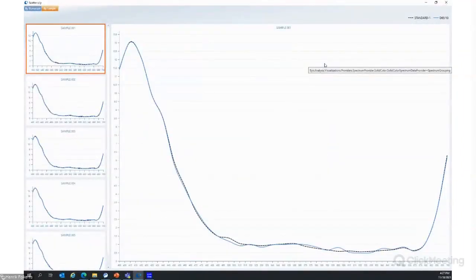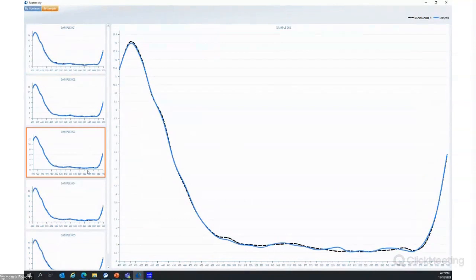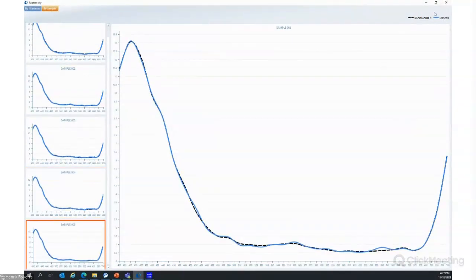That's why I have to move it to this screen I shared. You see, clicking on standard, it's highlighting here. This is the fingerprint, the reflection curve, the remission curve of the standard. Clicking on the blue one, this is the sample. So in this way, you can toggle through all the measurements you have. Okay, I will close that.